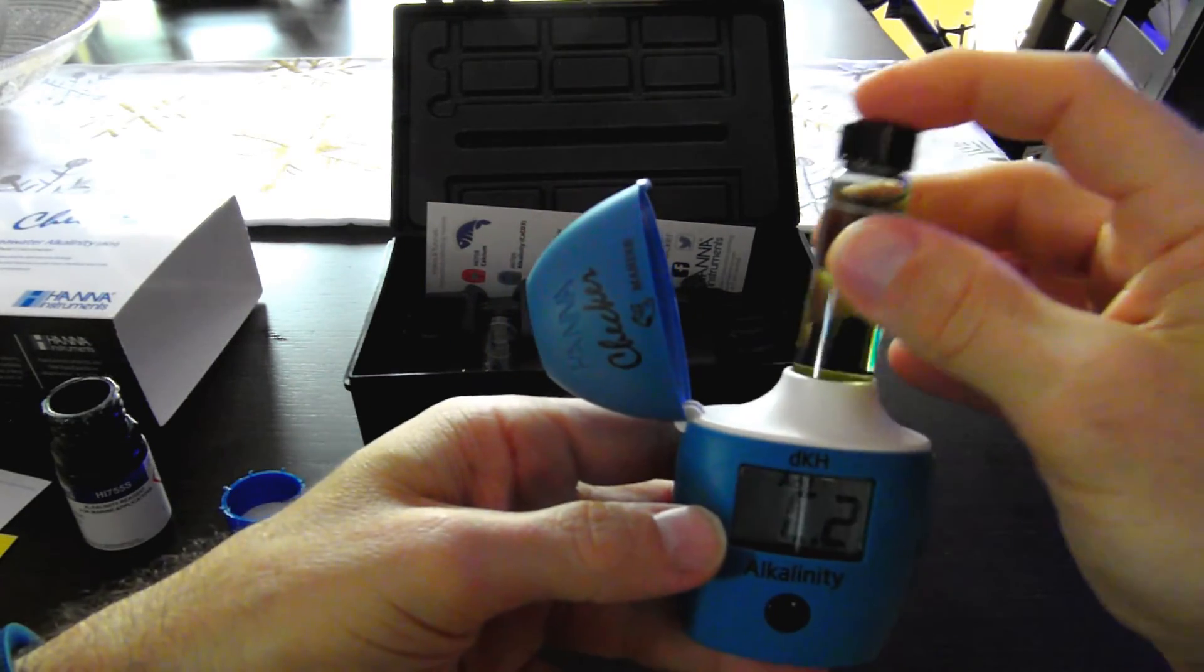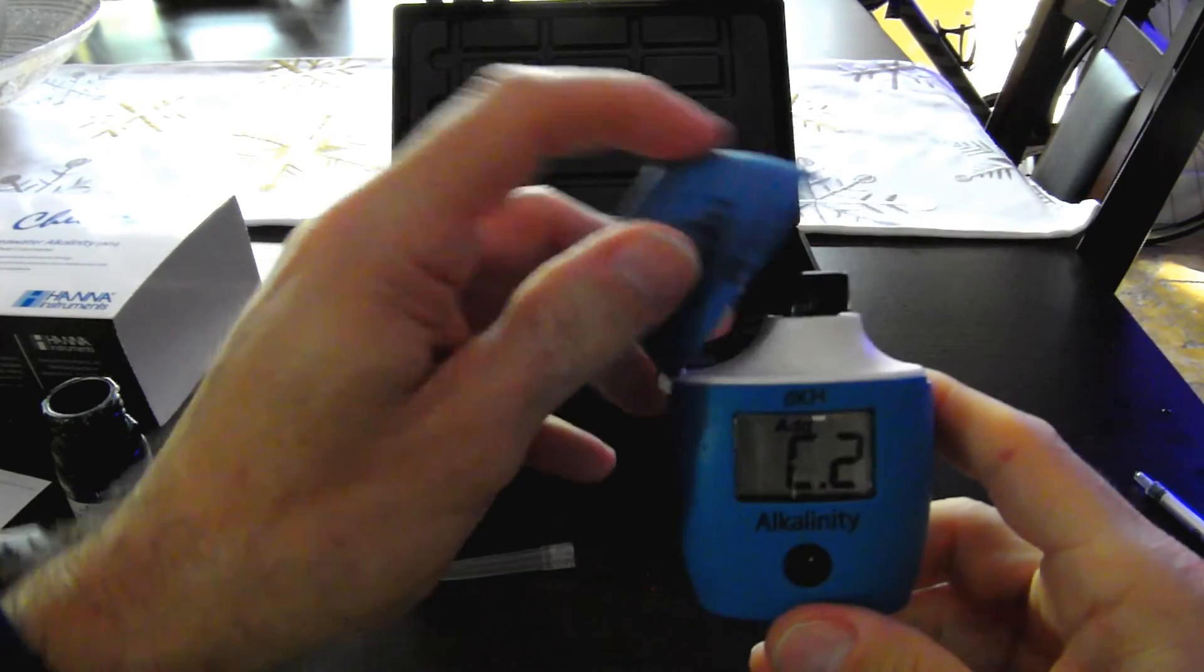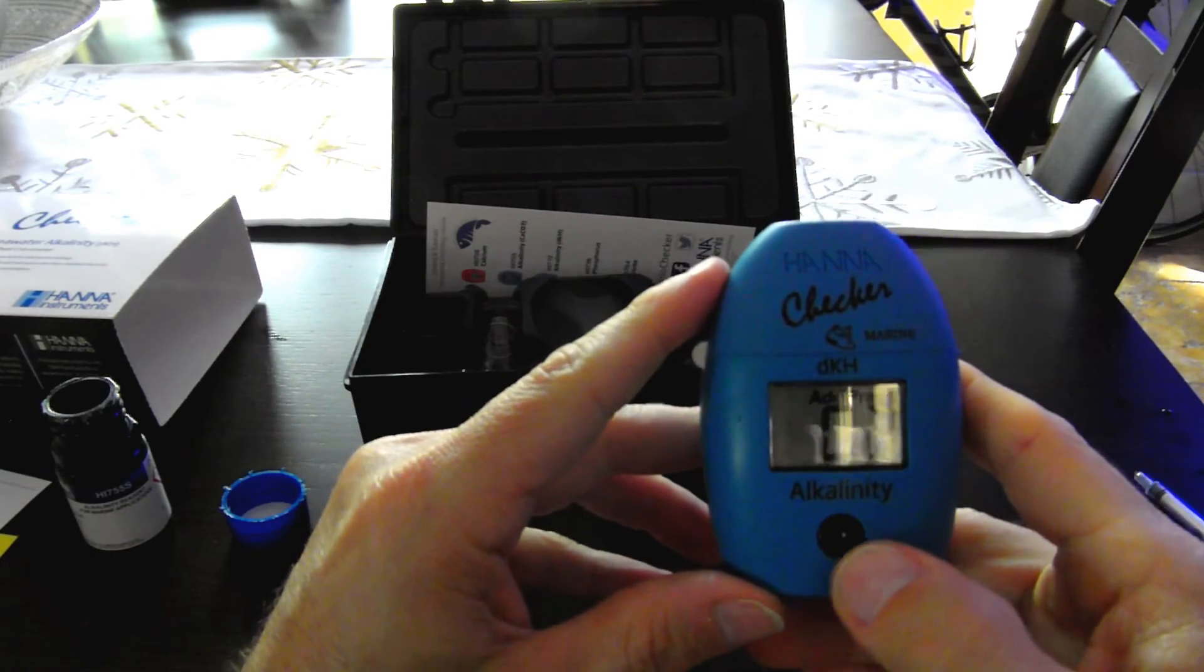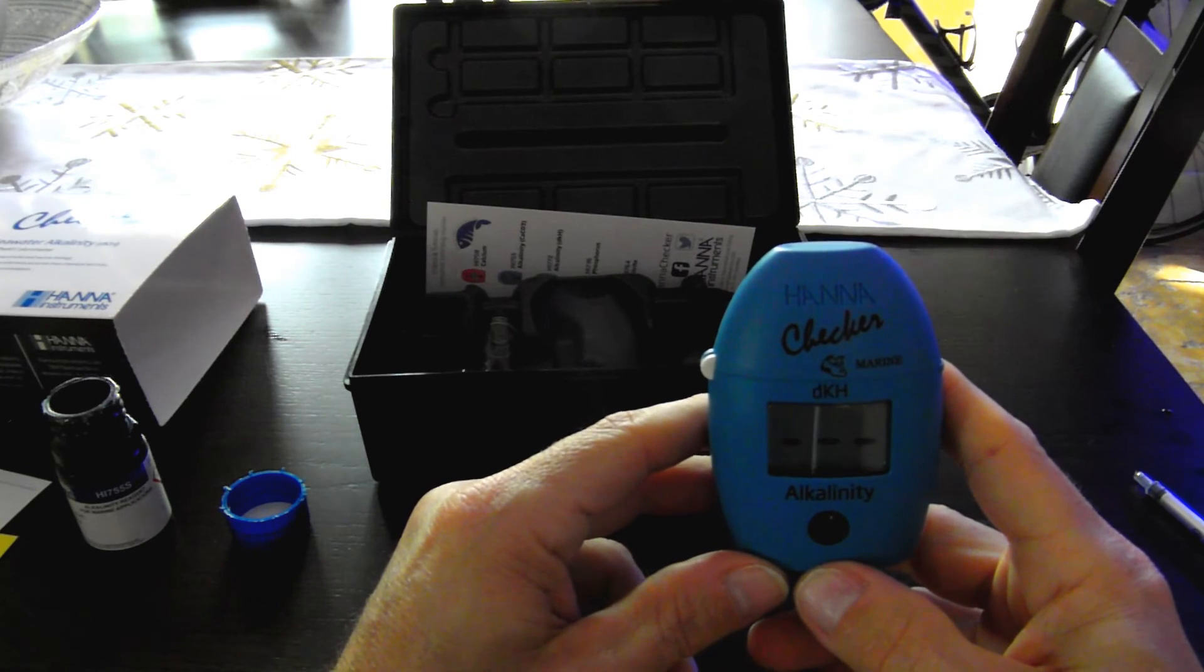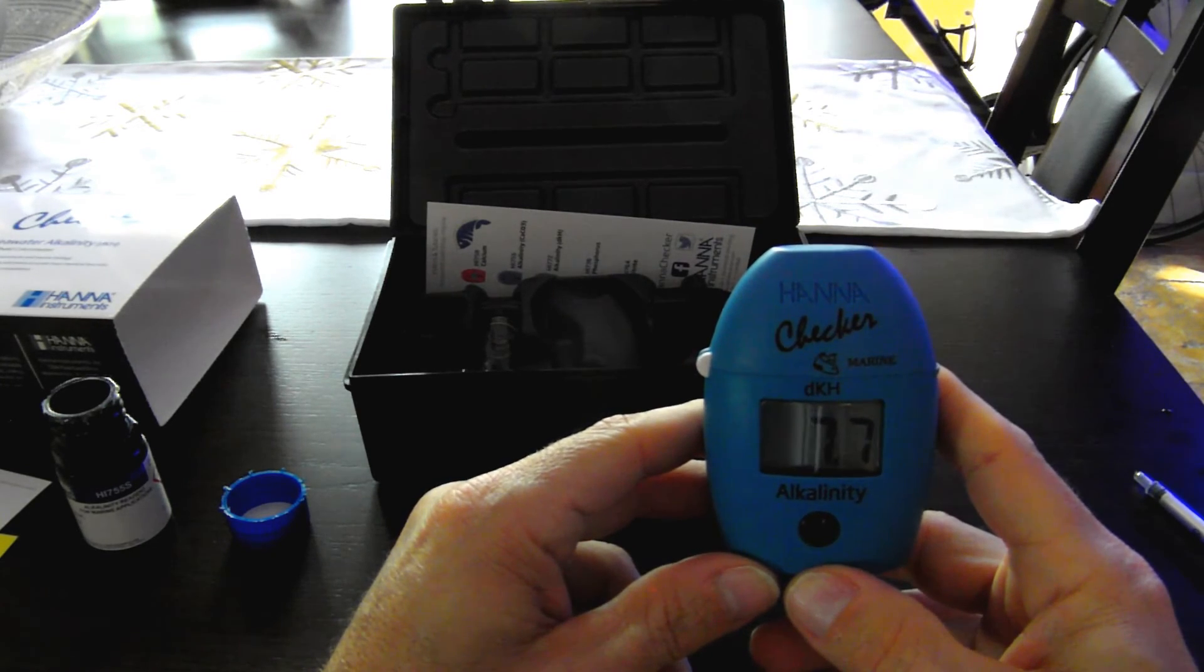It is waiting for sample 2, and I close the lid, snap it, and press the button, and then wait for the result. 7.7.